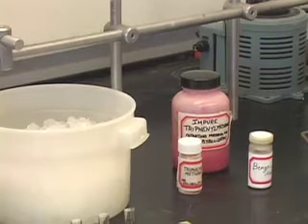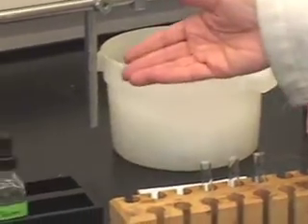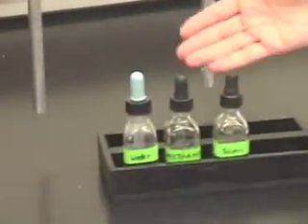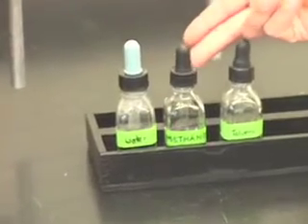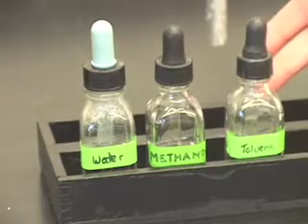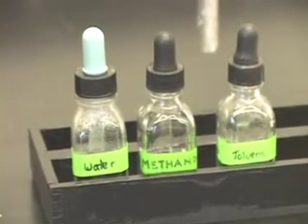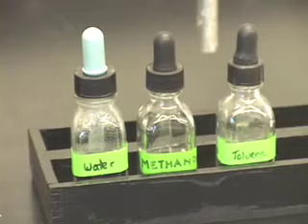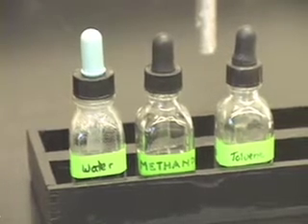The choice of solvents we have for today's recrystallization purposes are here. The first one is water, we have methanol and toluene. So, one of these three solvents is going to be the best one for recrystallizing impure triphenylmethane.